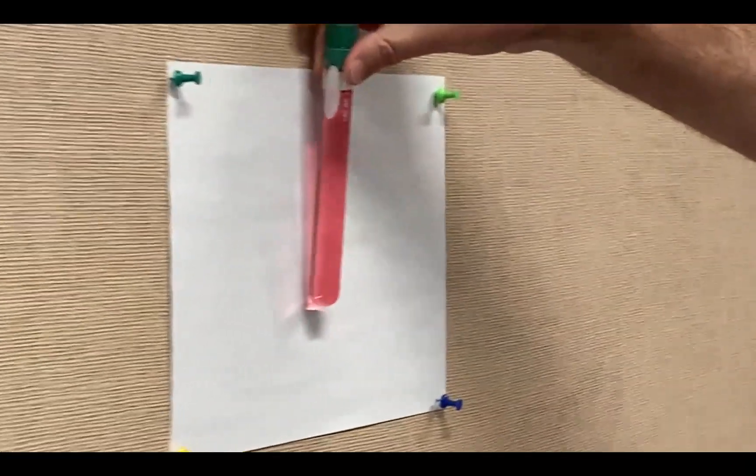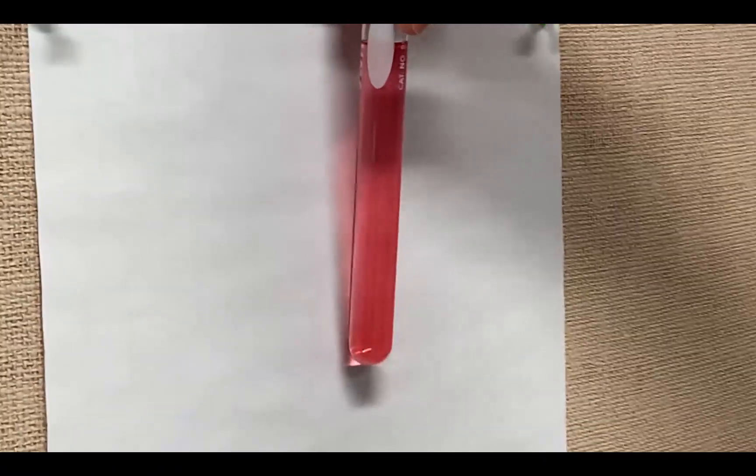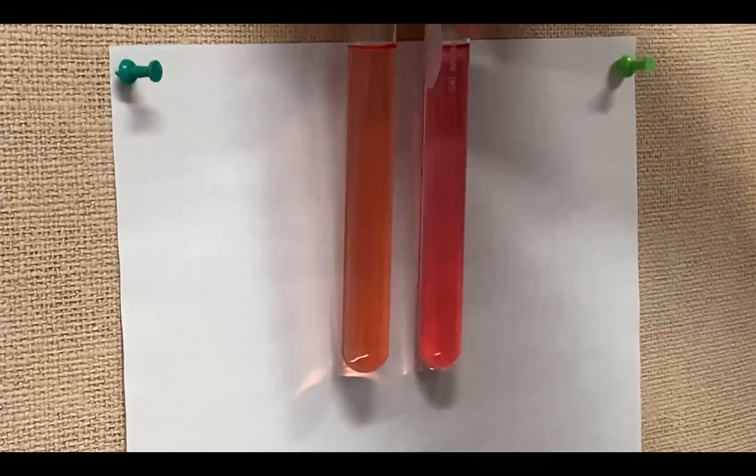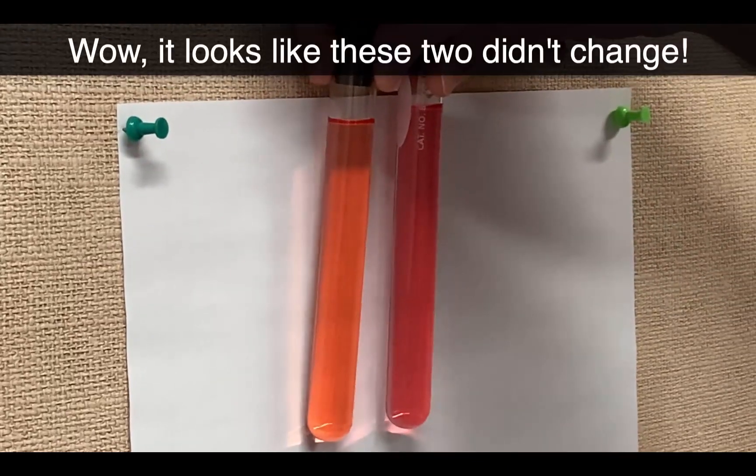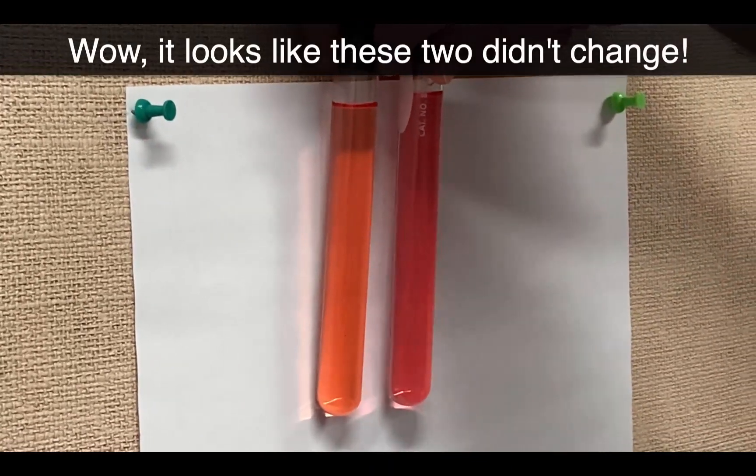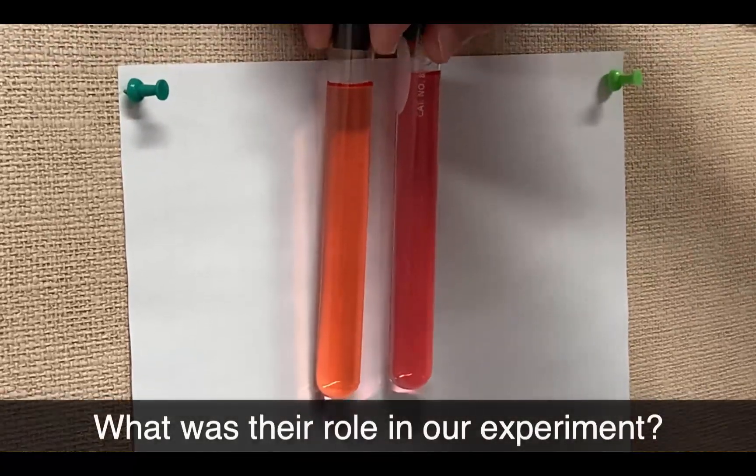If we take a look at tube number four, we can still see that nice pink there. I can hold up tube number three next to it to ensure they are indeed still different colors, just as they were when we first placed them in.